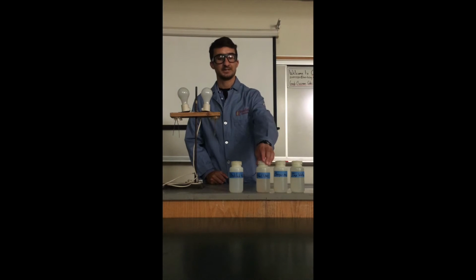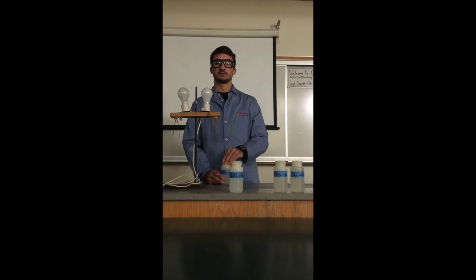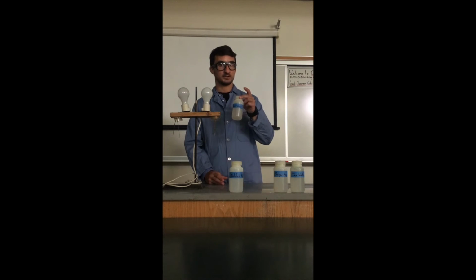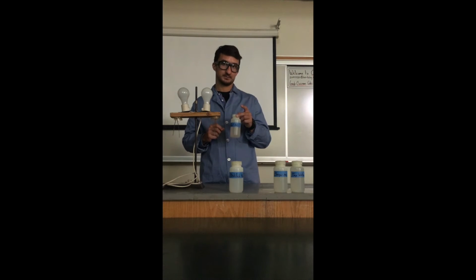Next one we're going to do is NaCl, table salt, dissolved in water, a salt water solution. So make your prediction, will it conduct or not? Now this is just water, it's the same thing we had before, but I've added a sprinkle of salt to it, which is dissolved.